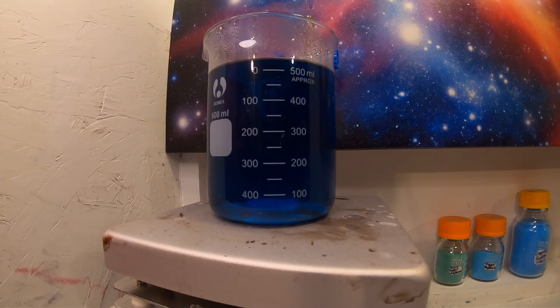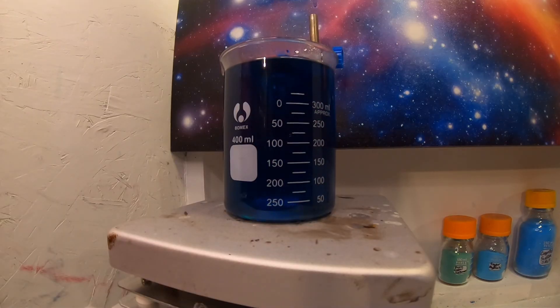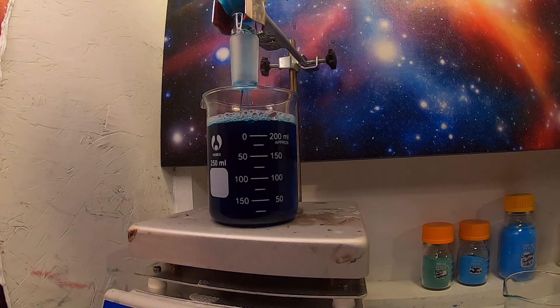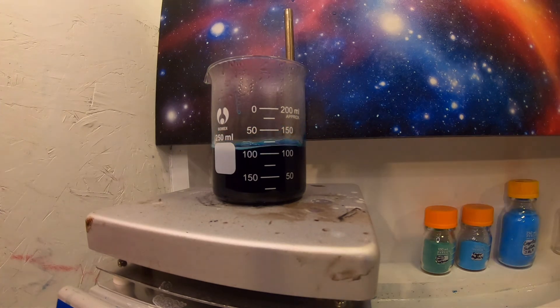So, two chemists walk into a bar. One tells the bartender, I'll have an H2O. The other says, I'll have an H2O too. The second chemist dies. Want to hear a joke about nitrogen oxide? No. Anyone know any jokes about sodium? Nah. I filtered the copper acetate solution once more because I saw some crud floating around. Are all these jokes too basic for you, because I see no reaction? I'd give you some more chemistry jokes, but all the good ones are gone.